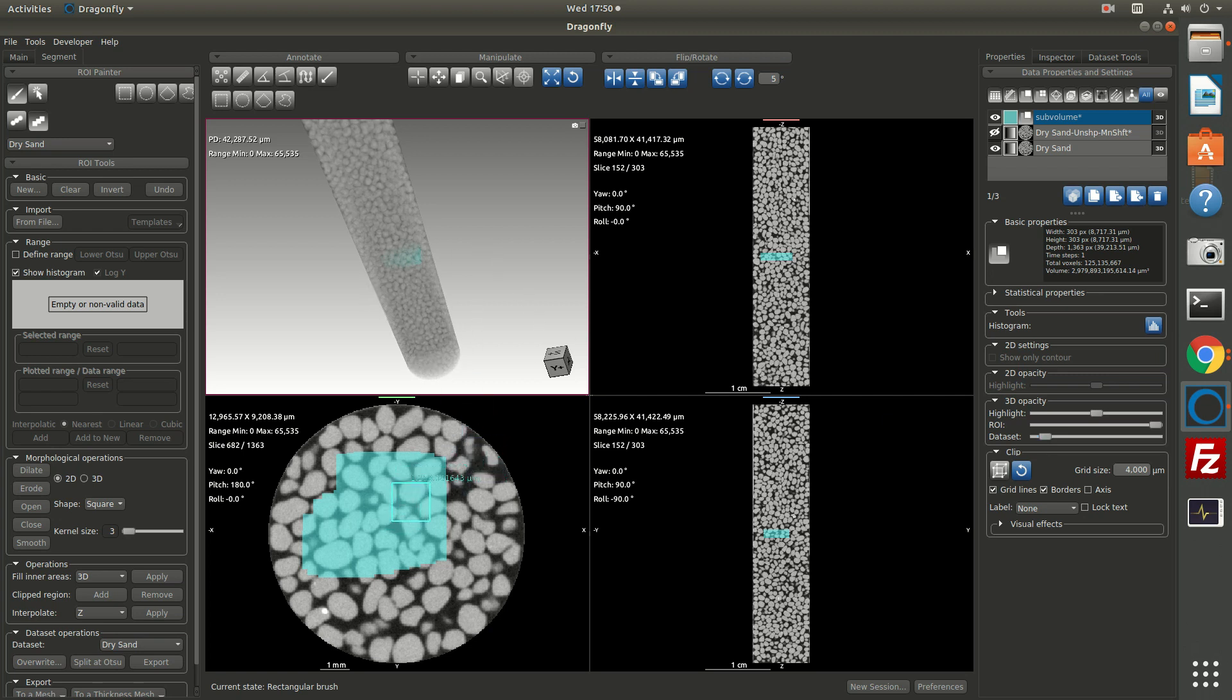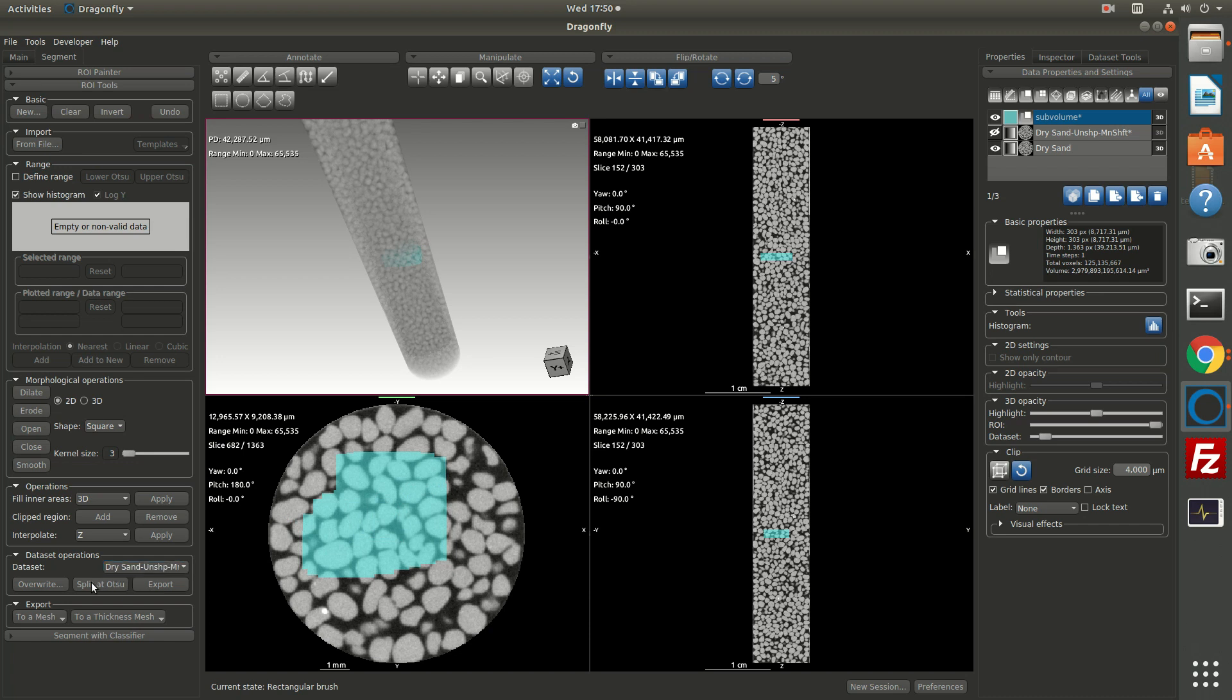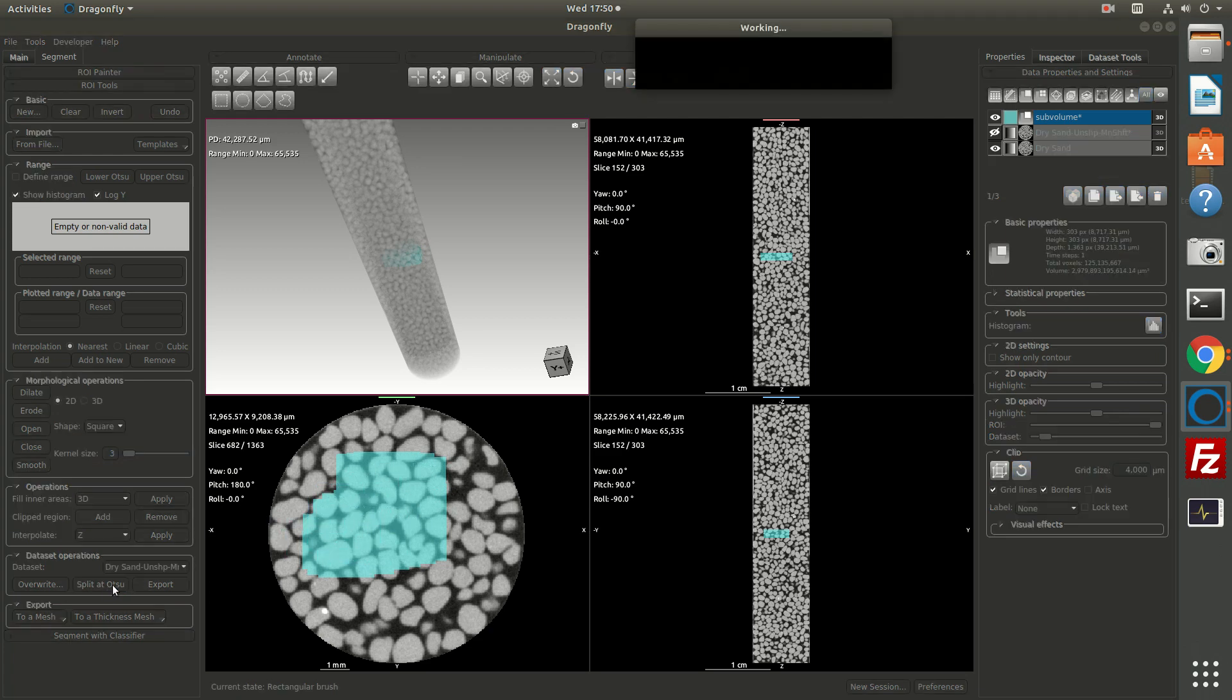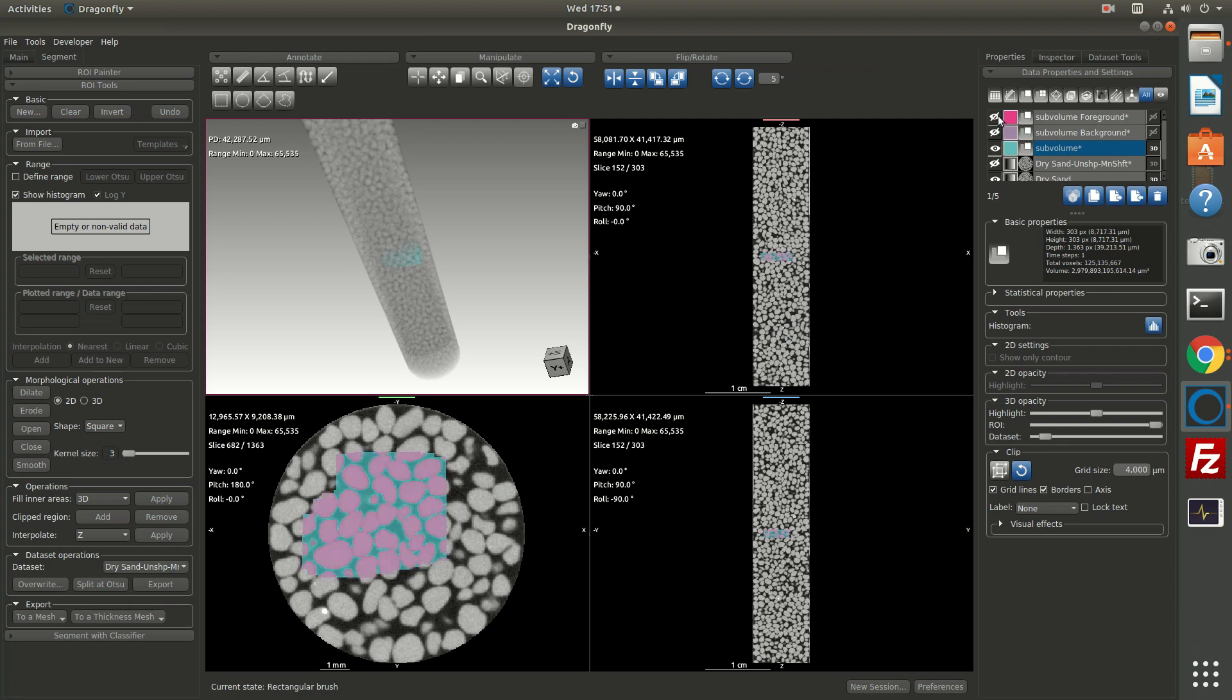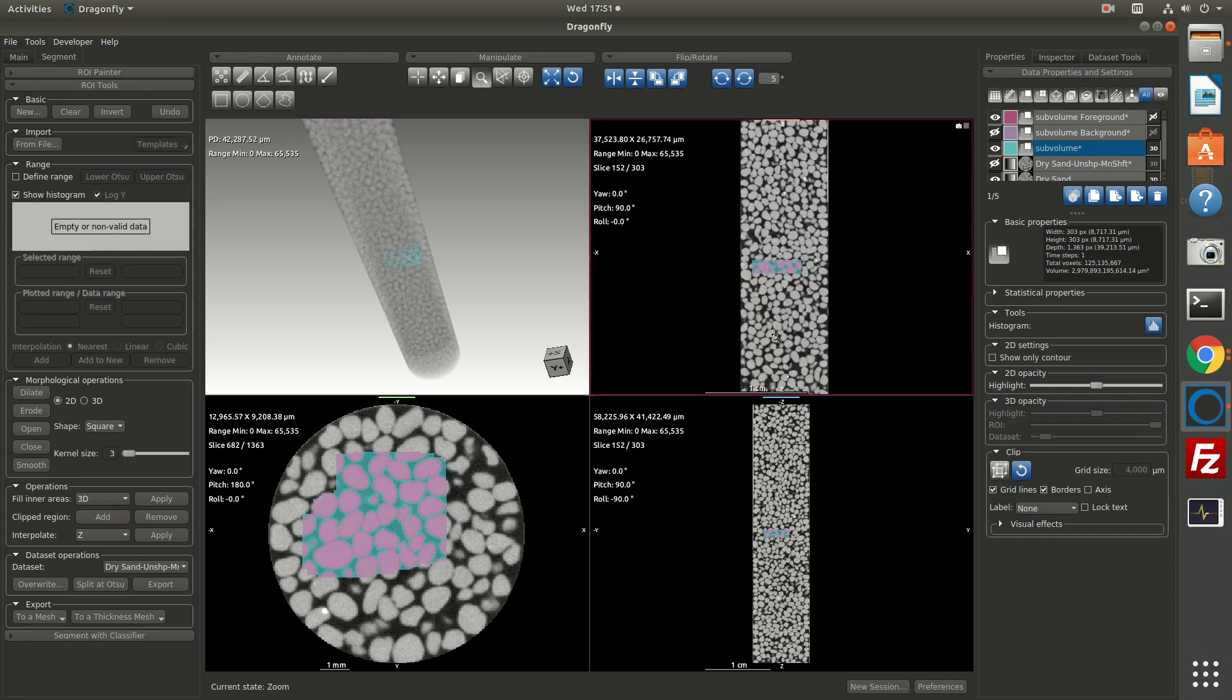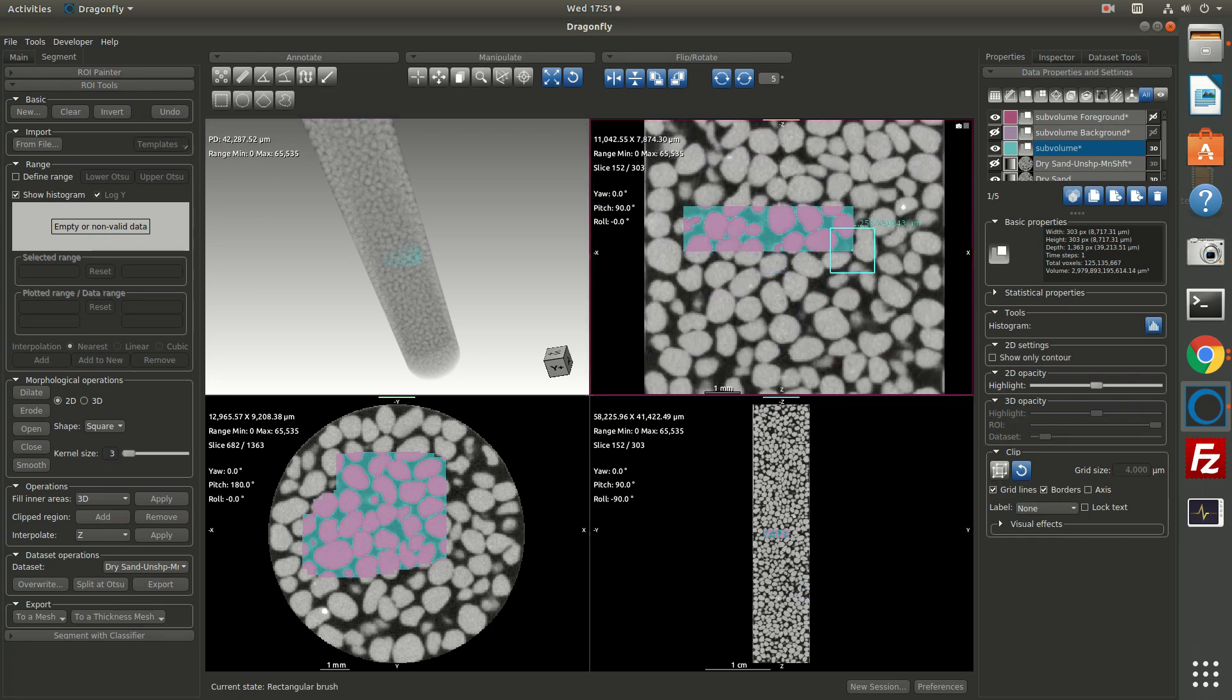The reason I painted this region of interest is with this sub volume selected, I could come over here to ROI tools and at the bottom I can ask Dragonfly to look at this ROI and the image which has been sharpened and smoothed and apply a split at OTSU. What this does is it looks at the histogram of just the segmented pixels and provides an optimal threshold. So in this case we have the background, which is the pore space, and the foreground, which is the grains.